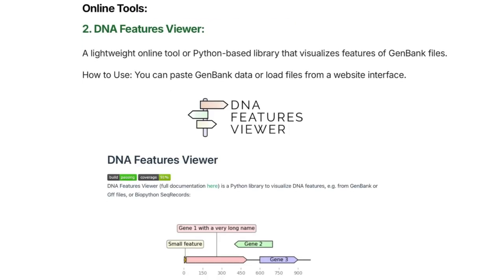Another online tool is DNA Features Viewer. This is a lightweight, Python-based library that visualizes features of GenBank files. You can paste your GenBank data or load files from a website interface to use it.